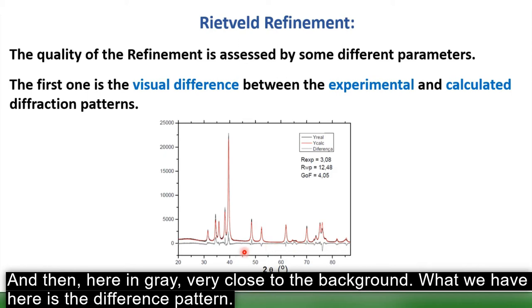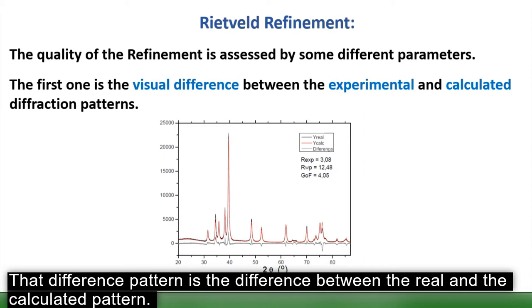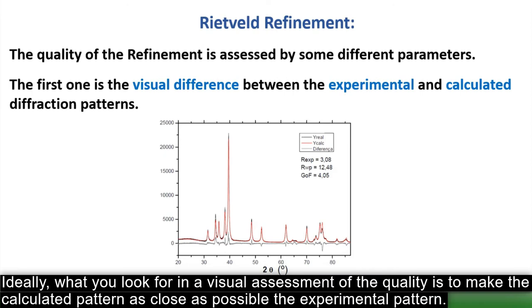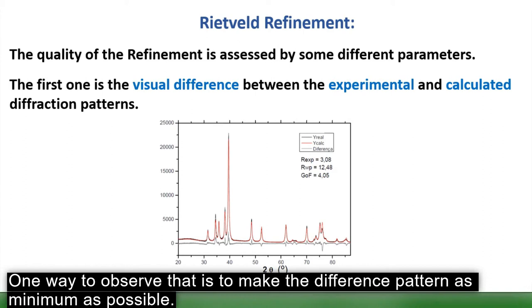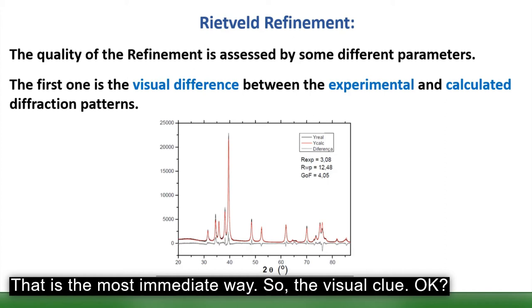In gray, very close to the background, is the difference pattern — the difference between the experimental and the calculated pattern. Ideally, in a visual assessment of quality, you want the calculated (red) pattern to match the experimental pattern as closely as possible, making the difference pattern as minimal as possible. That's the most immediate visual indicator.